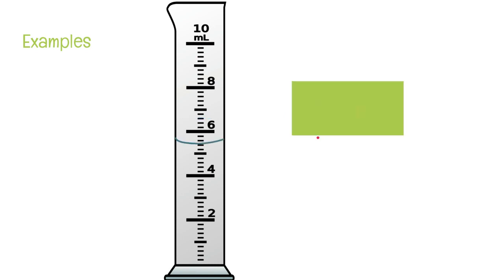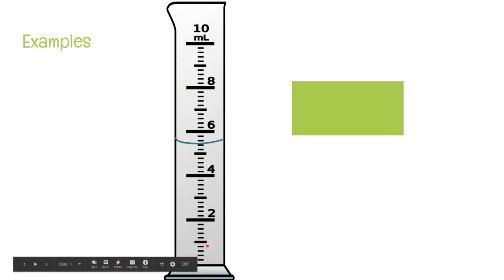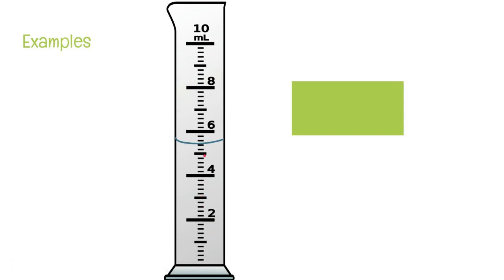Last. I don't know if you noticed, the line just moved here. This one right here is not falling exactly on a line. Should I give you a second to figure it out? Can you do it? I know you can do it. Here we go. This is 1. That's 2, 3, 4, 5, 6. This liquid level is falling in between 5 and 6. So my leading digit is going to have to be 5. There's going to be a 5 right there. Now the question is, it's 5 point what?